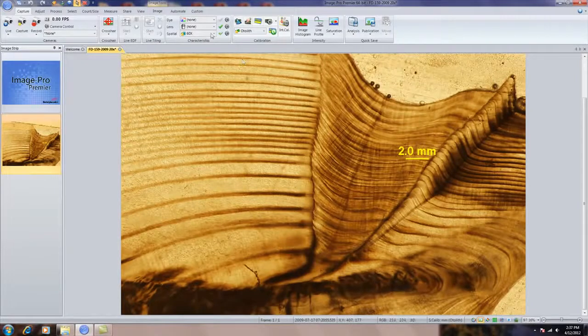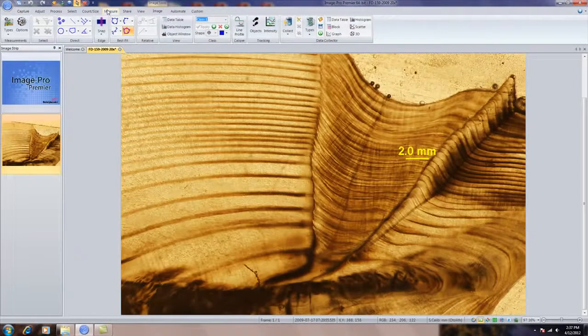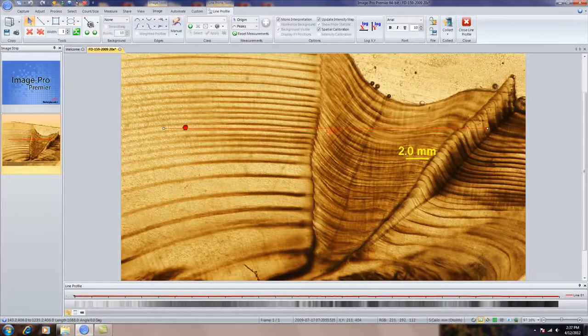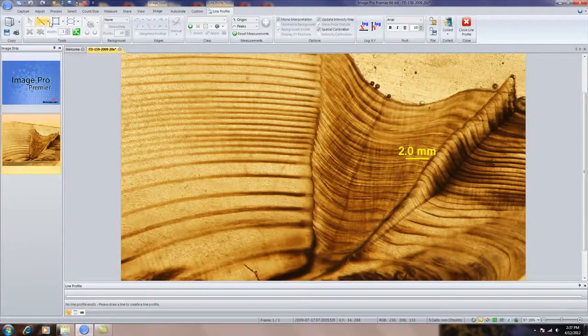So to do that, first we'll go to the Measure tab and select Line Profile Caliper. Automatically, what you'll notice is a line profile is automatically placed on the image. We can use this for automated edge detection, or we can delete that and choose to draw any one of our sampling tools here, whether it's a rectangle, polygon, any type of circle, or line or polyline.